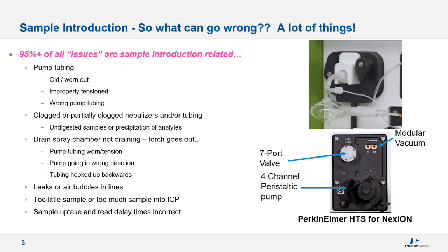As most of you attending this talk know, a lot of things can go wrong along the way. The key message I would like to communicate today is that 95% or more of the things that can go wrong leading to problems with your results are typically sample introduction related. By sample introduction, I mean everything that happens before the sample actually makes it into the plasma. This could be old, worn, or improperly tensioned pump tubing causing erratic delivery of your sample to the plasma.